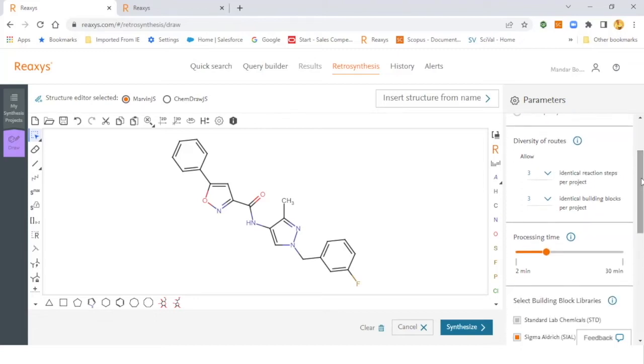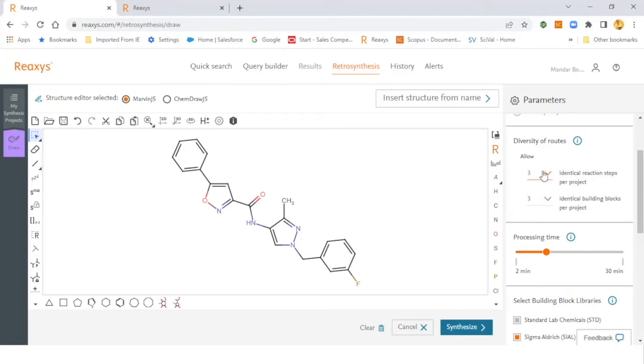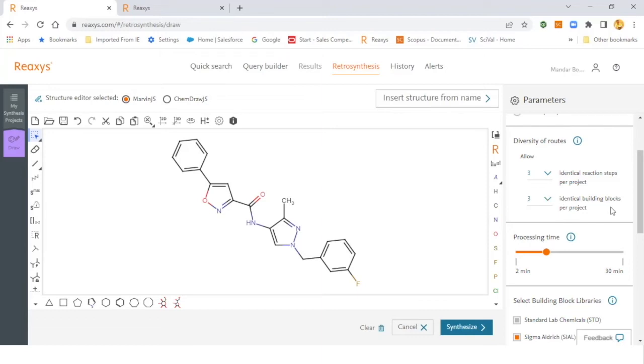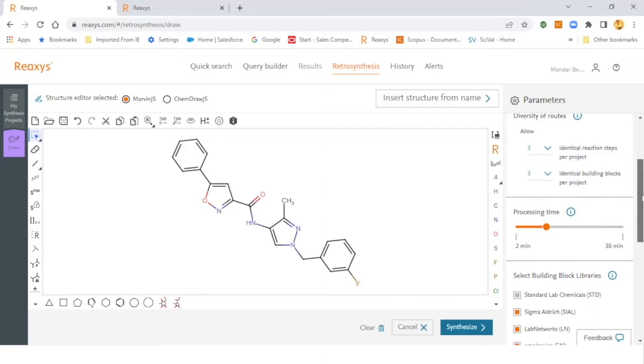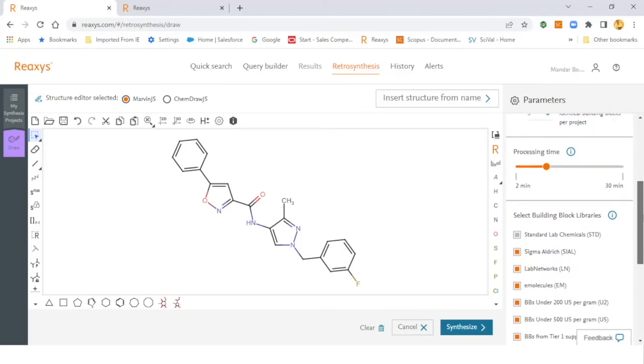Then you have another parameter of diversity of routes, which will allow you to play around with the diversity. In this particular case, I have the default function of three and three. The three for identical reaction steps per project means that if you have more than 10 routes, then the reaction step for each route will only be repeated three times out of those 10 routes. Similarly, if you have chosen three for identical building blocks per project, then the building blocks or the starting materials for every route will only get reported three times out of those 10 routes.